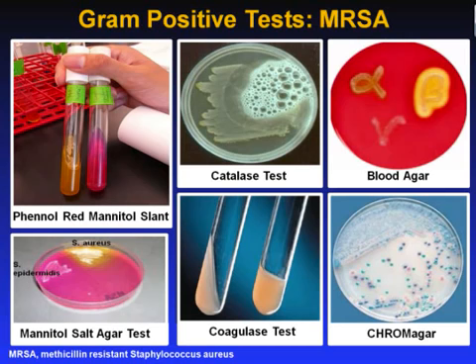While the catalase test alone cannot identify a particular organism, combined with other tests such as antibiotic resistance, it can aid in diagnosis. The presence of catalase in bacterial cells depends on both the growth condition and the medium used to grow the cells.